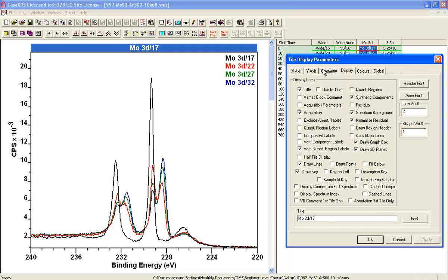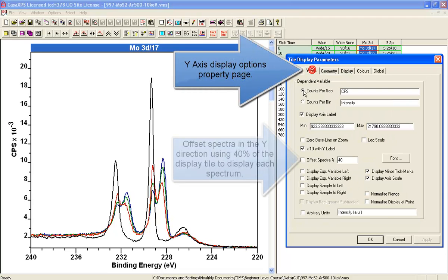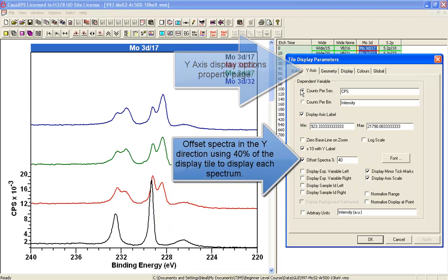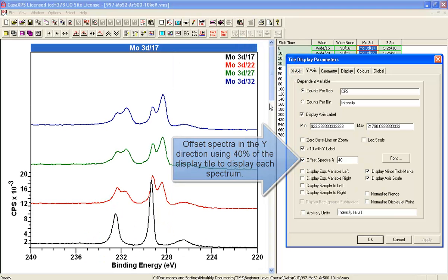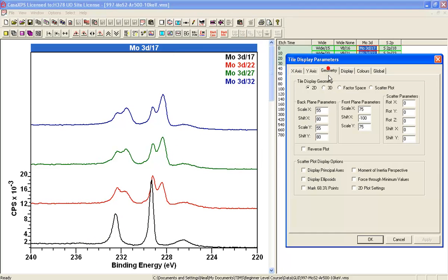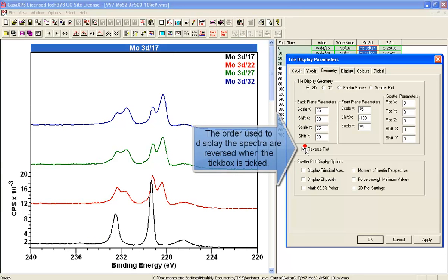In addition to plotting them overlaid, you can offset them using the y-axis to offset spectra, and you can reverse the order using the geometry option reverse plot.